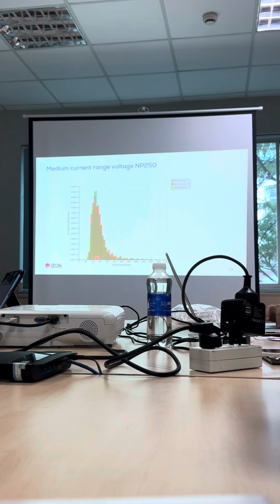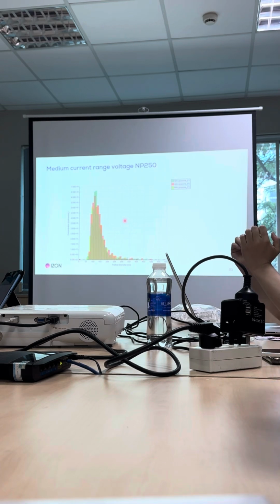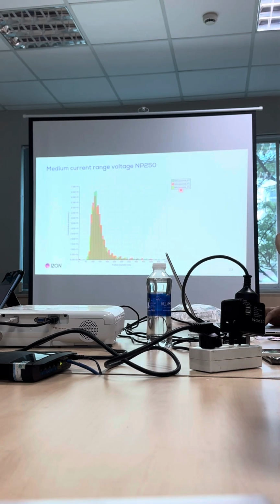Our recent method is that we can use a thin nanopore to measure quite a large range. For example, this one is from a cosmetic company. They are providing liposome products. We can say TRPS can measure from 50 to around 500 nanometers by using the middle current range. This is an advanced method. In such a range, do you still remember the first picture I showed about NTA? It's more accurate for large particle sizes.